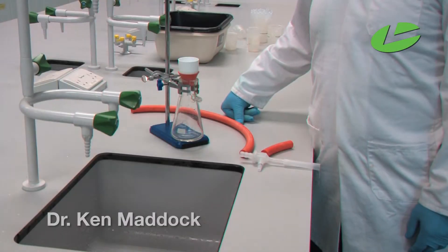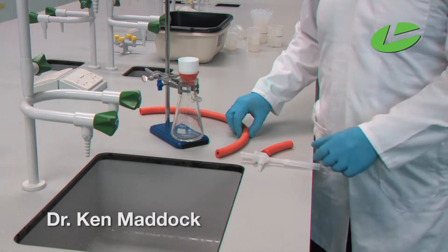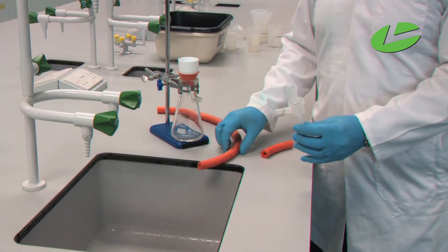To assemble a water aspirator system for Büchner filtration, you need your water aspirator and two pieces of rubber tubing.